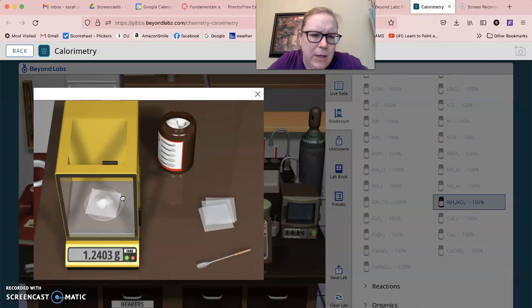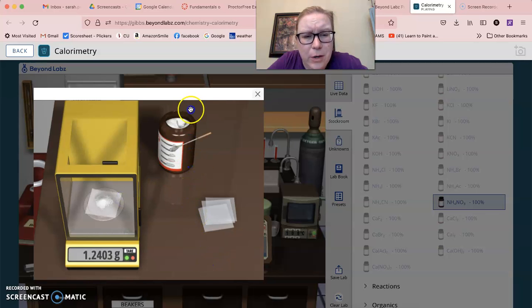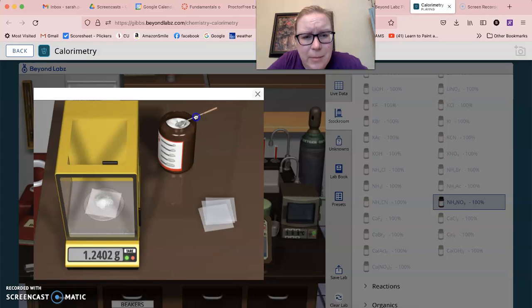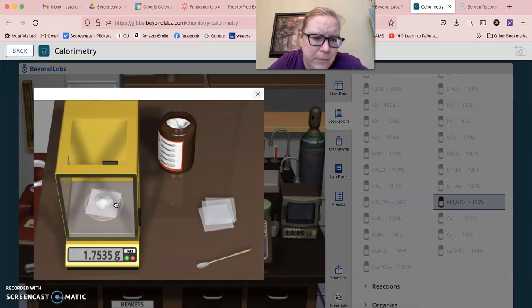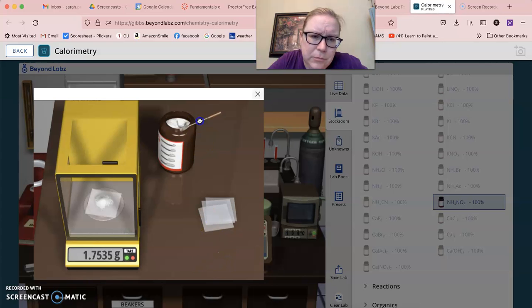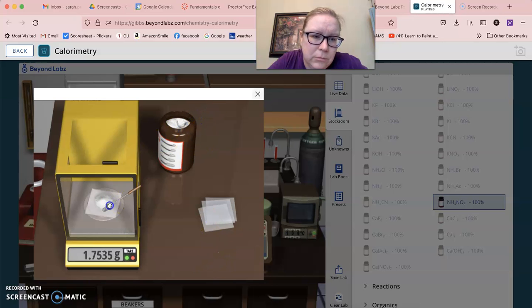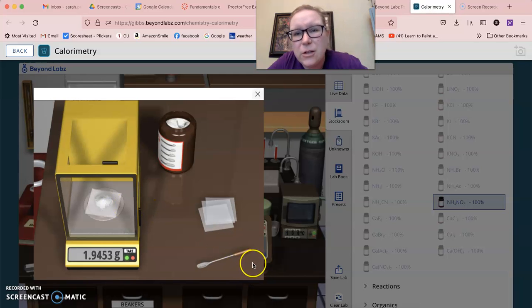Okay, then we're going to go here. And then I need a little bit more because I need about two grams. Again, this doesn't have to be exact, but to see that biggest change we do want it to be two grams. All right, so that's close enough. That's what I would record.